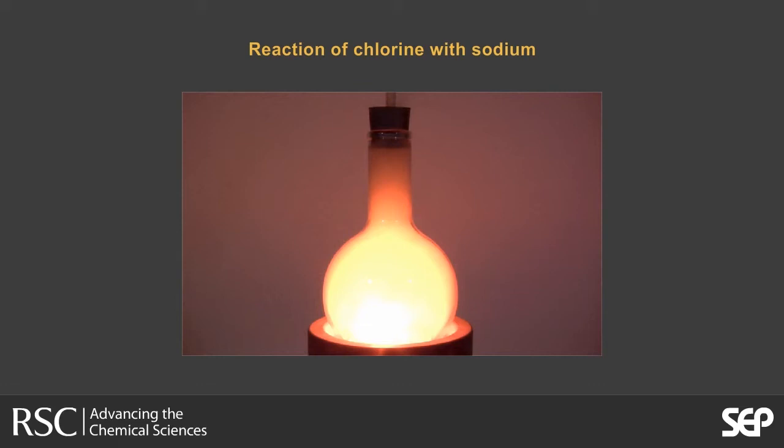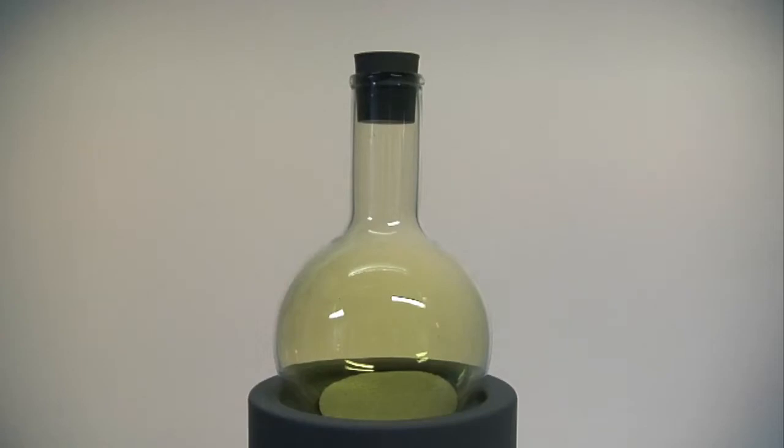This reaction can be safely demonstrated in school. In this case, chlorine has been placed in a flask, and some sand is used to protect the glass from the heat produced in the reaction.